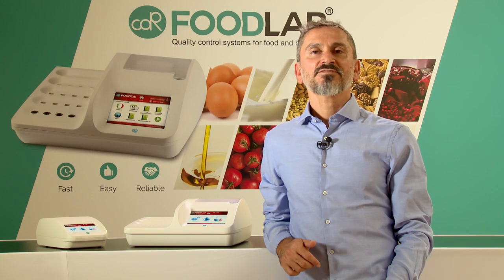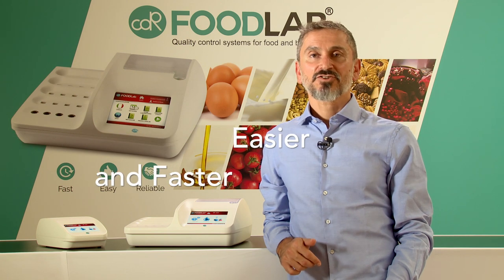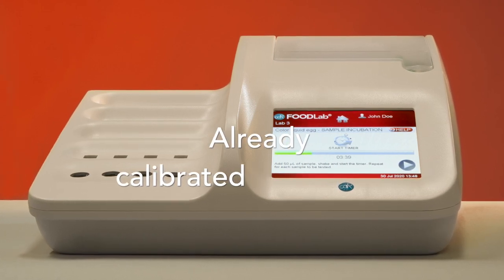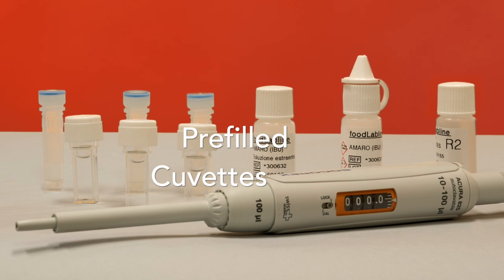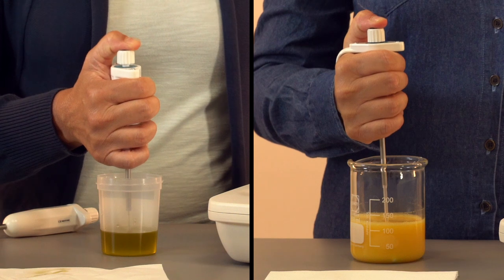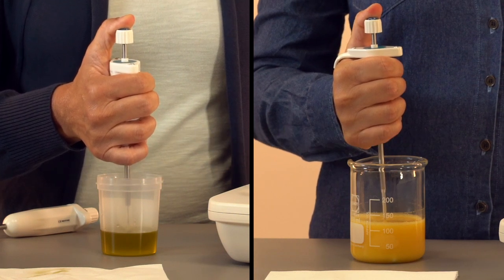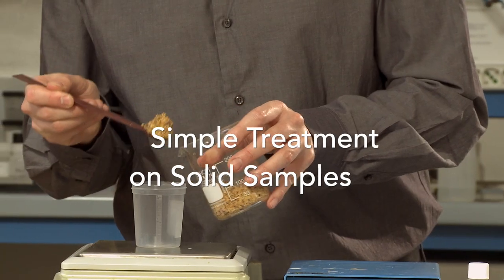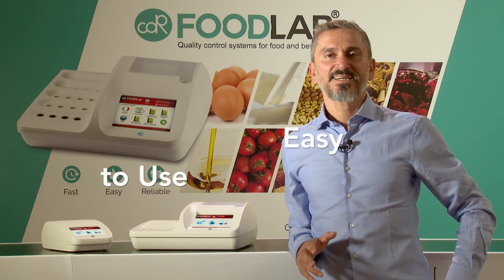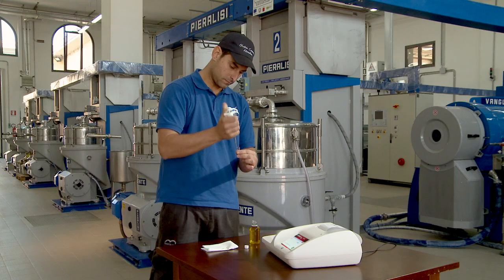The strengths of the system are the analytical procedures easier and faster than traditional methods. The analyzers are supplied already calibrated with all the procedures preloaded. The reagents are prefilled in the cubit and so ready to use. In most cases we analyze the sample as it is without treatment, if it is liquid, or with a simple treatment on solid samples. For this reason, anyone can use CDR Food Lab, not just technicians in the laboratory but also non-specialized users at the production line.